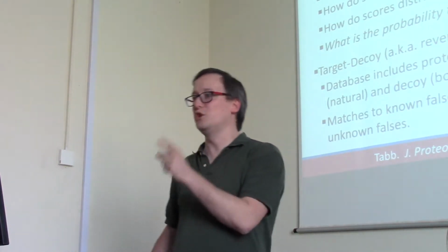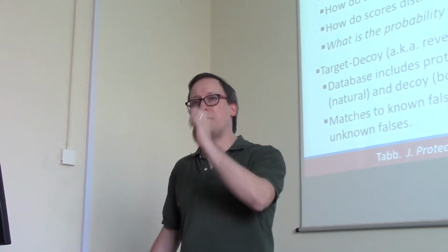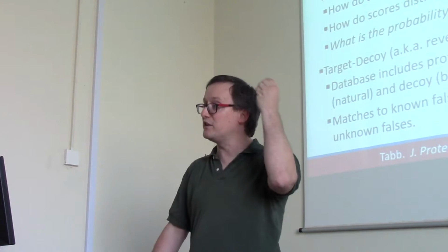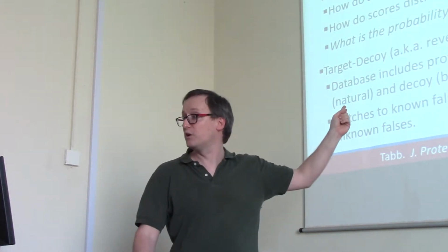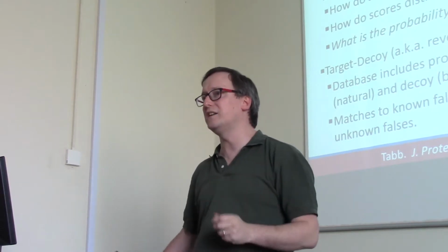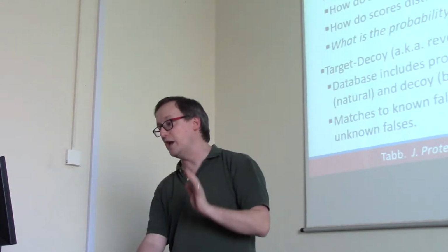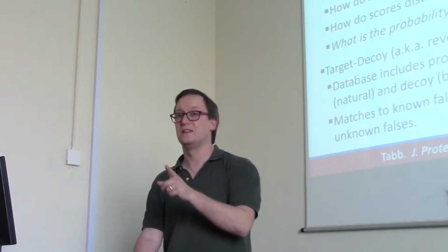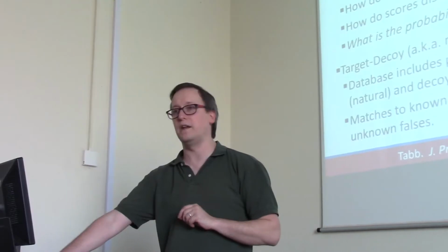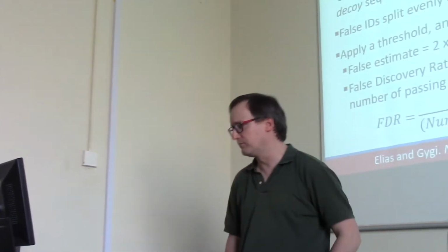That's right, back in the genomic sequencing work, we were talking about Phred scores as a probability of error for each base call. So the corresponding way to do that in the proteomics world is to come up with a probability for each PSM. The math behind it is too complex for a lecture that has to cover these many topics. So for now, I'm going to bypass that. But I will talk to you about target-decoy search. This is a method that people use all the time in proteomics, and it's very much worth your knowing.